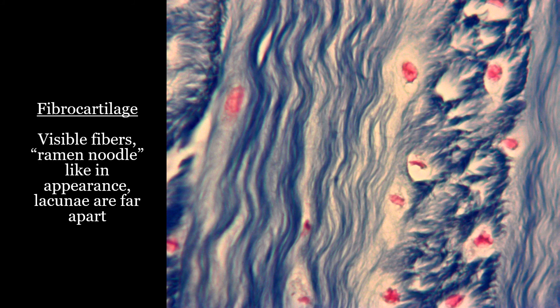So if you said this was elastic cartilage, I'm sorry, but I tricked you. It is once again fibrocartilage because you're seeing those ramen noodle fibers, and the lacunae are kind of spread far apart.